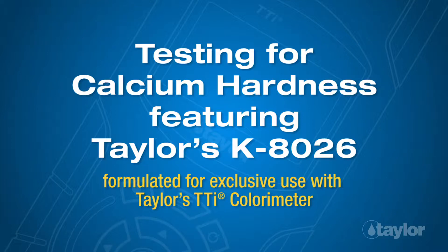Testing for Calcium Hardness, featuring Taylor's K8026, formulated for exclusive use with Taylor's TTI Colorimeter.